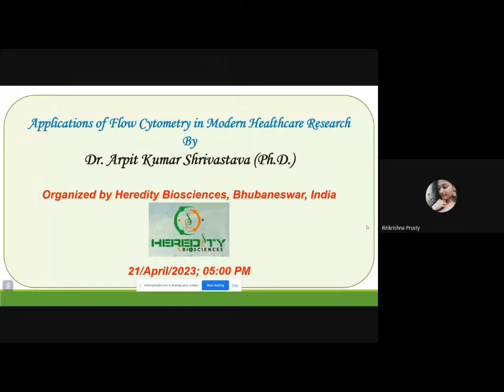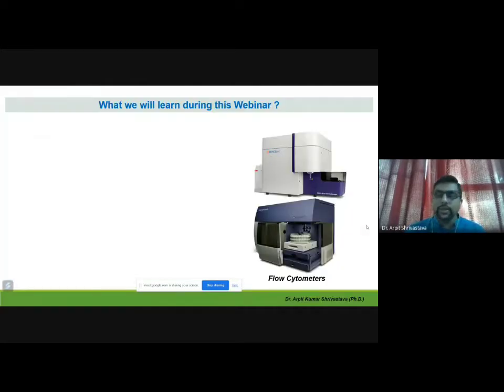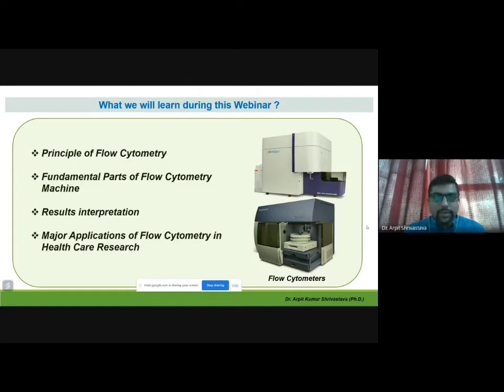Good, thank you. So today we will discuss the applications of flow cytometry in modern healthcare research. I believe you may know a little about the flow cytometry technique, or if not, then we will discuss a few things. By the end of this webinar, we will learn the principle of flow cytometry, the fundamental parts of the machine, and how it functions.